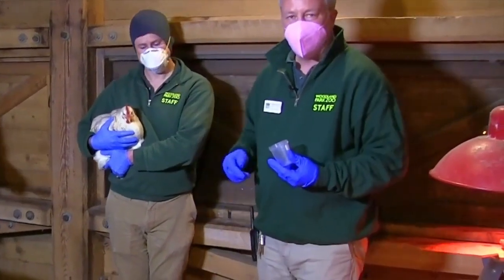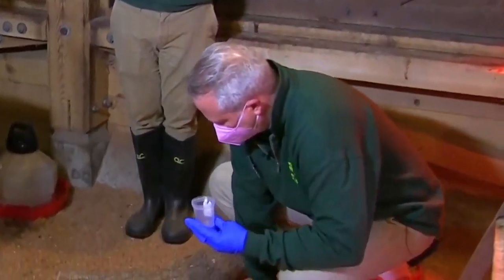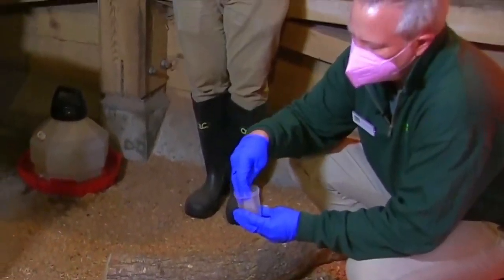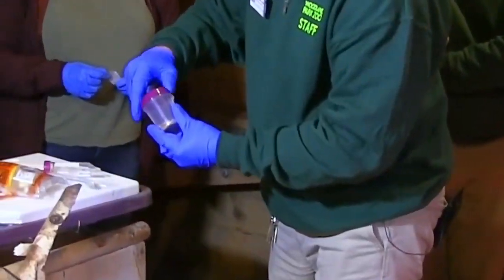I'm also going to take a sample of the substrate, which is the bedding material in the enclosure. I'm going to take a sterile collection jar and just take a random sample of this material. It doesn't have to be a lot. Put that in the container and close that up.